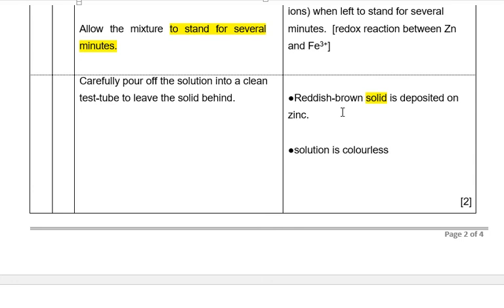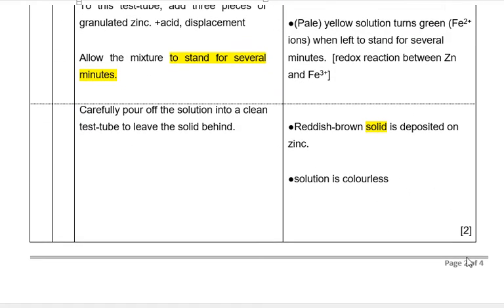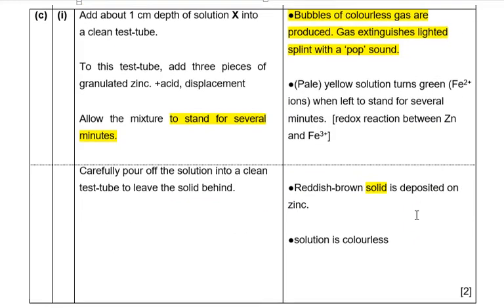Okay, now what else? Other than the solid form, the other observation that you can make is of course the color of the solution. So the solution is colorless. Okay, so I have a few observations here for you to score 2 marks. Okay, last part.